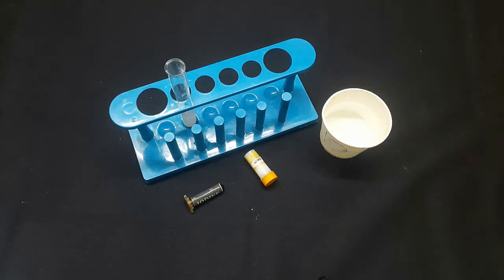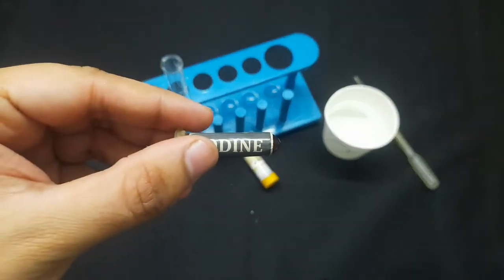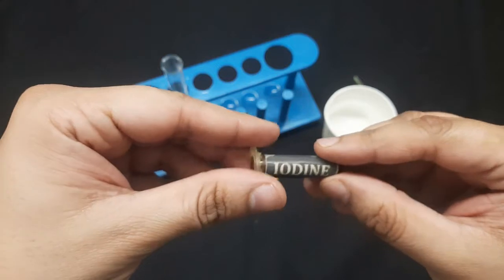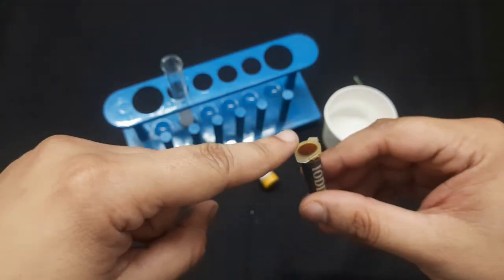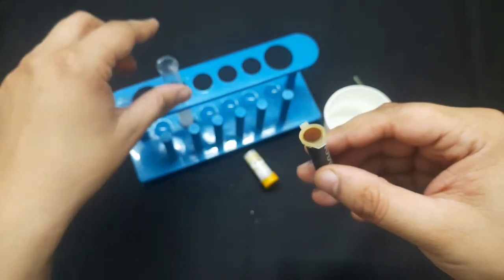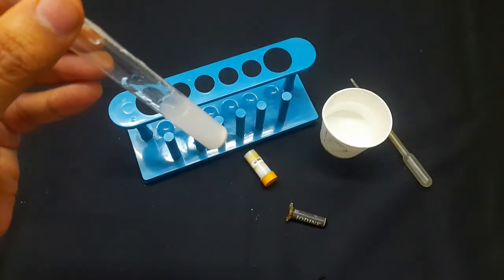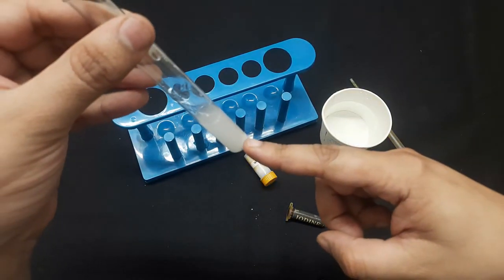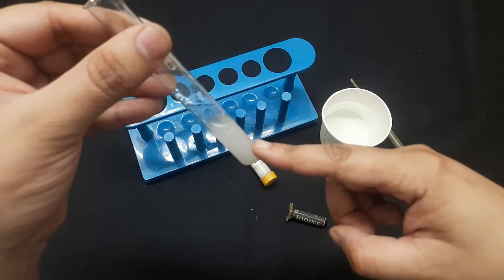And the next step is that we have to use the iodine. So we already have iodine in our kit. So this is the iodine solution. We have to take 1 or 2 drops of iodine solution with the help of a dropper, and once we put 2 or 3 drops of iodine solution inside this starch powder, immediately this white color will change into a deep blue or black color.